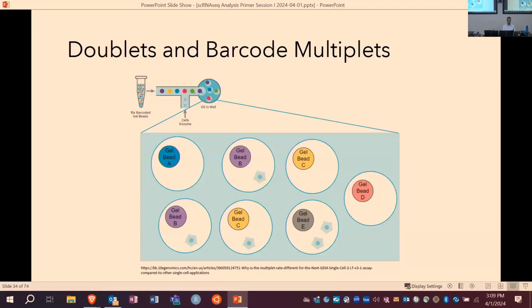So when you add those together, you don't have a huge error, the way you might have with heterotypic doublets, where 2 cells of different cell types are placed into the same GEM well. That is a much worse situation, where you have this confounding effect of cell type by expression.